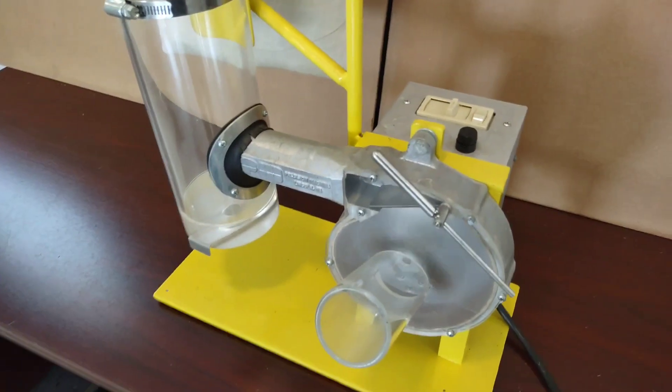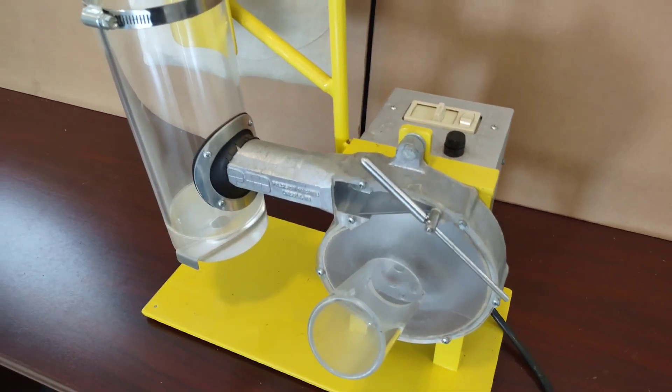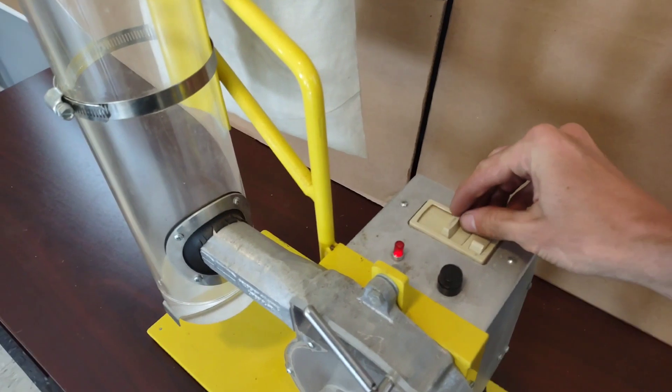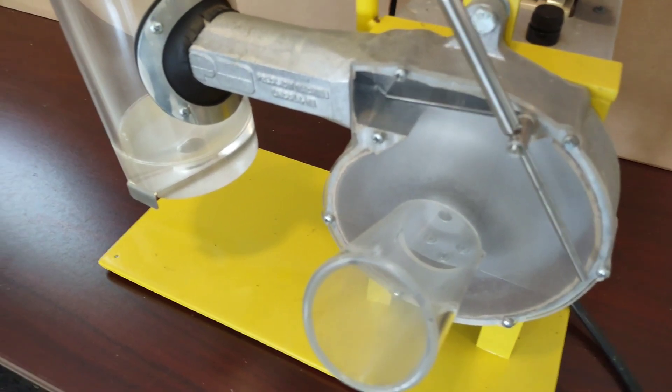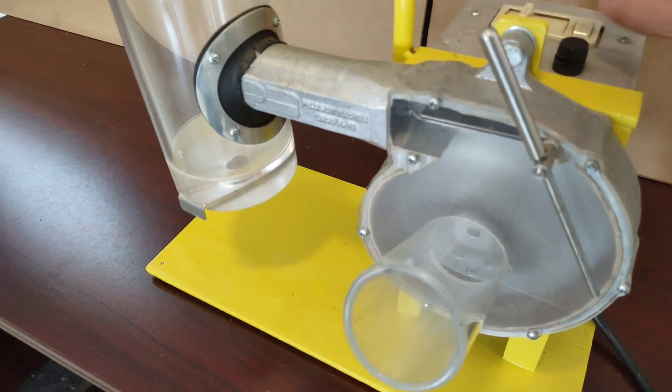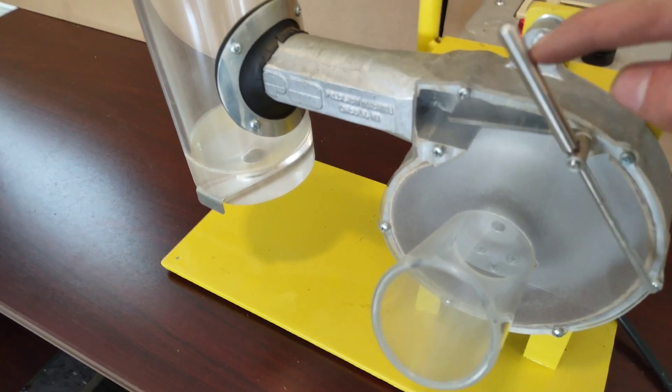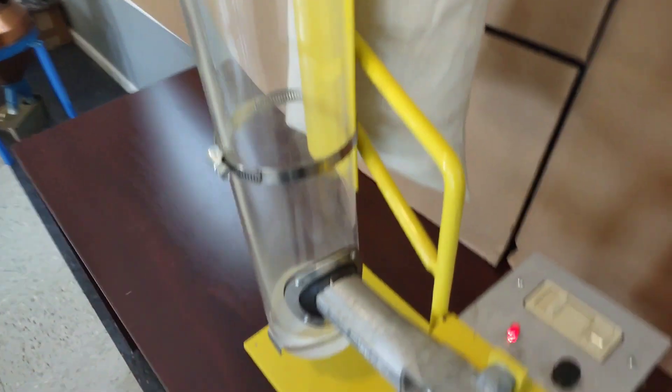Right now it's turned down really low. We'll use the rheostat knob to increase the speed. You can see it's picking up, it's actually blown the door open, and the bag has filled with air, so that's good.